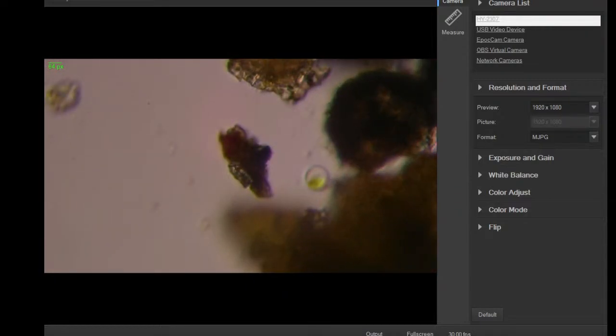These little wiggly bits right by this green dude. Those are bacteria wiggling under Brownian motion from heat from the lamp, moving the water molecules around them. So a lot of bacteria have their own ability to move, but sometimes they're just parked like this and they just wiggle. Just like Mr. Wiggly.